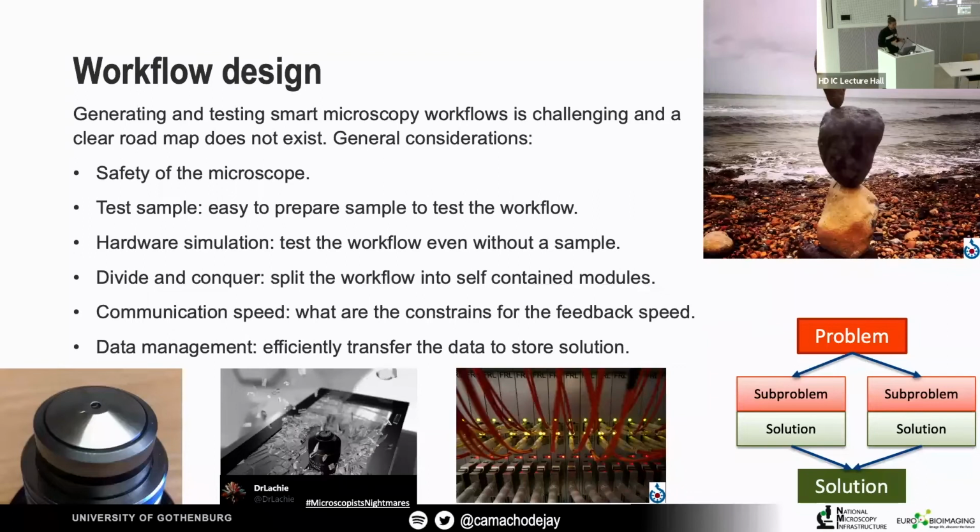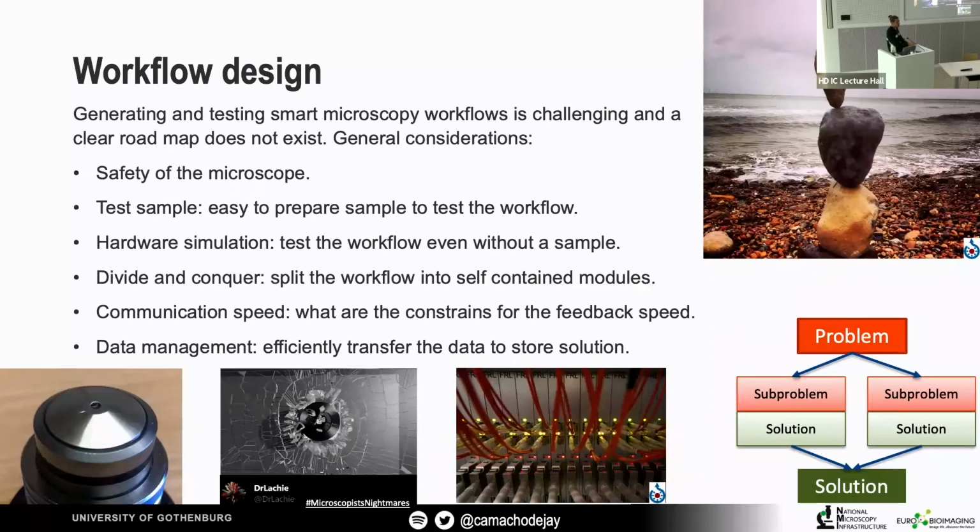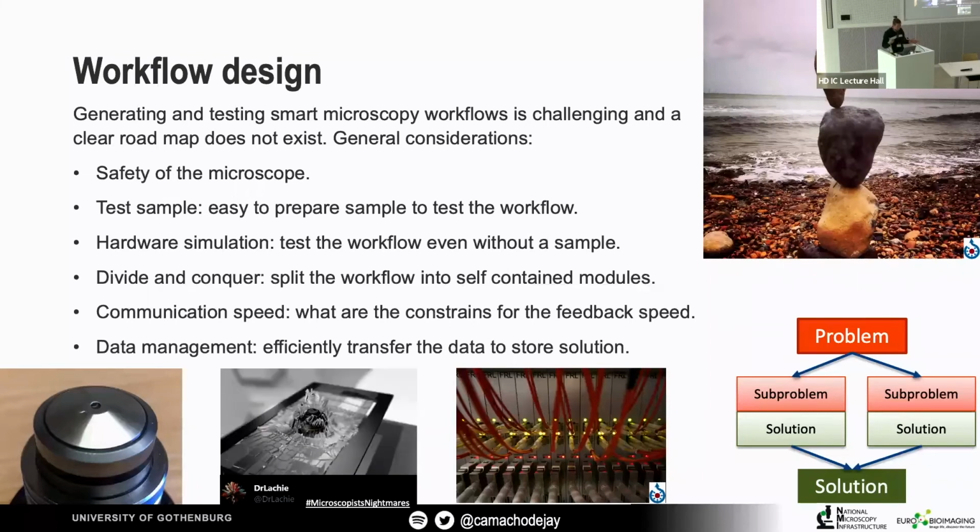So, of course, the first thing that we should try to do is, how can we build safety into the microscope in such a way that I know that during the whole thing, when I'm testing it, I'm not going to break my microscope, right? So I would say that's consideration number one.